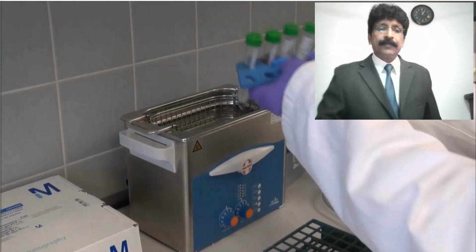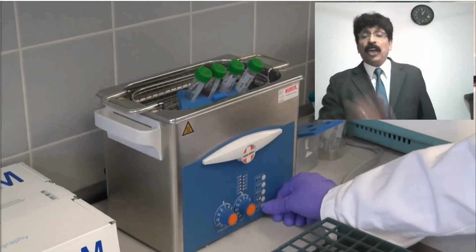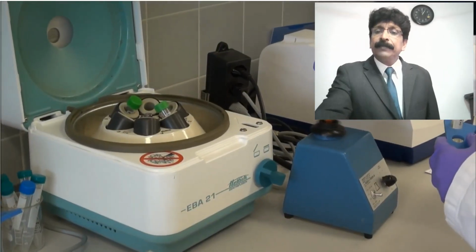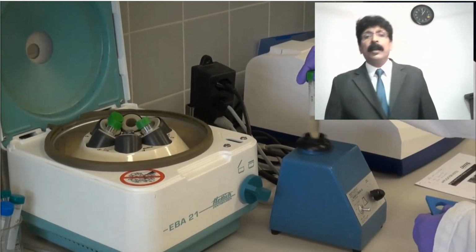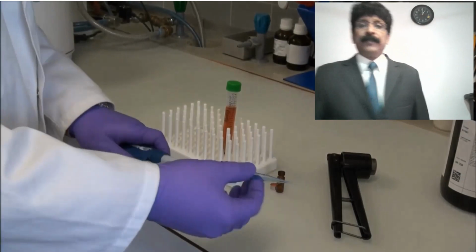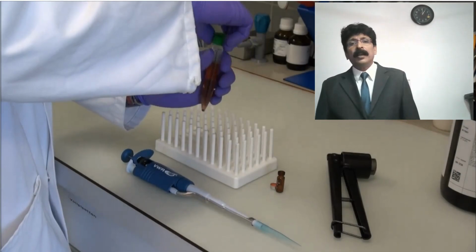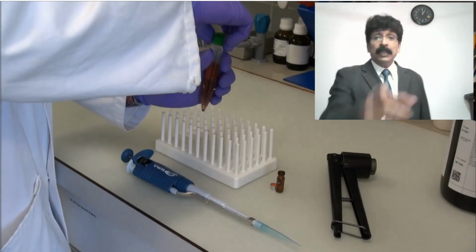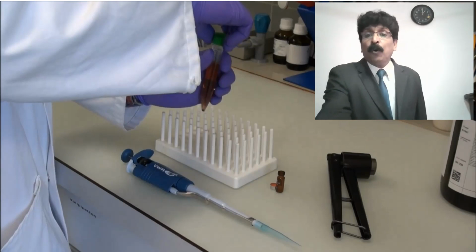You can see here in the procedure. See, first she is keeping it for ultrasonic solubilization by using ultrasonic rays, and then she is using the gyrator, and then the centrifuging machine at a rotation of 5000 RPM. Then afterwards you get the supernatant liquid from the centrifuge test tube as shown in the picture. In the video I just made it pass to help the students understand. It will be transferred to the vial which is kept on the floor. You can see on the table.